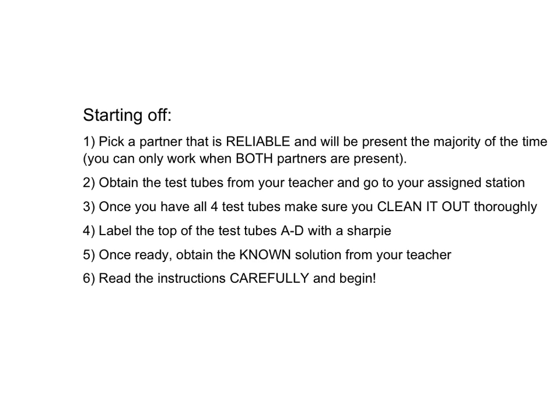you will get test tubes from your teacher, and I will assign you a station. Make sure you clean out those test tubes very, very thoroughly with DI water. You don't want any extra ions inside your solution from old experiments or anything like that. Make sure that your test tubes are labeled A through D with a Sharpie. You want them near the top so that they don't come off when you put them in the hot water bath. And when you're ready on Monday, you'll come in, grab your test tubes, and get your known solution. And then it'll be off to the races.